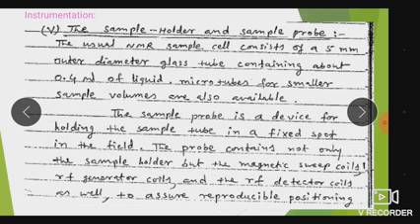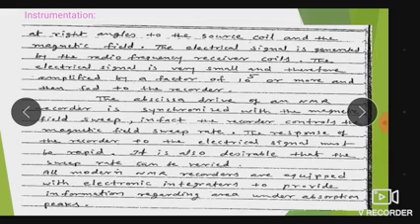So with the help of the recorder, with the abscissa, we can record the spectrum with the varying frequency as well as the varying field. The abscissa of an NMR recorder is synchronized with the magnetic field sweep. In fact, the recorder controls the magnetic field sweep rate.